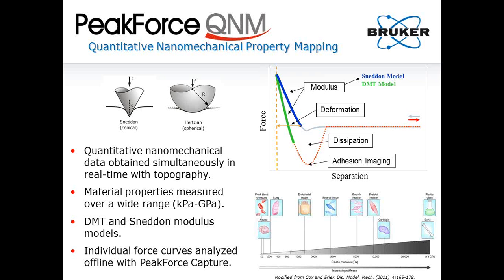In addition, we also have the ability to examine and analyze individual PeakForce QNM force curves offline with PeakForce Capture, like you can also do with force volume or force spectroscopy curves. And this allows for direct comparison of data obtained with the different modes.